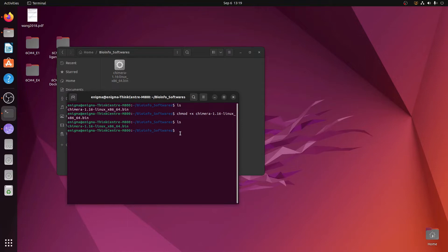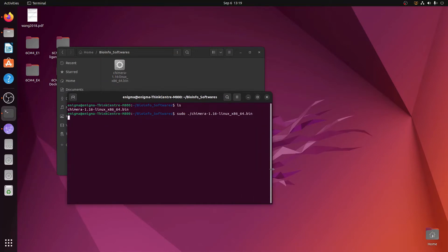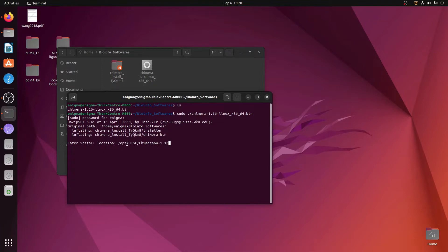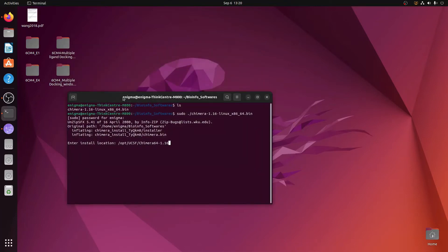To install, type the command: sudo — which stands for super user — then a full stop and slash, then type 'ch i' and press Tab to auto-complete the full name, then press Enter. It will ask for your password; enter your system password and hit Enter. It will then tell you the location where it is trying to install UCSF Chimera, which is /opt/ucsf/chimera.